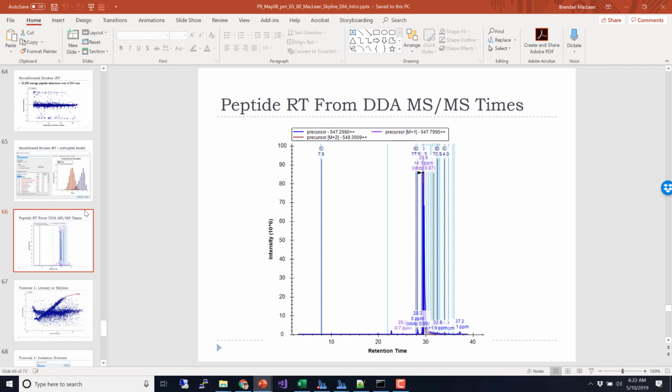Just because they were injected at a very high concentration, we get tailing, and we keep identifying it way out there. And when I don't have the peak to look at, if you think about a tool trying to figure out where the peak is based on a whole bunch of IDs like this, it becomes more complicated.